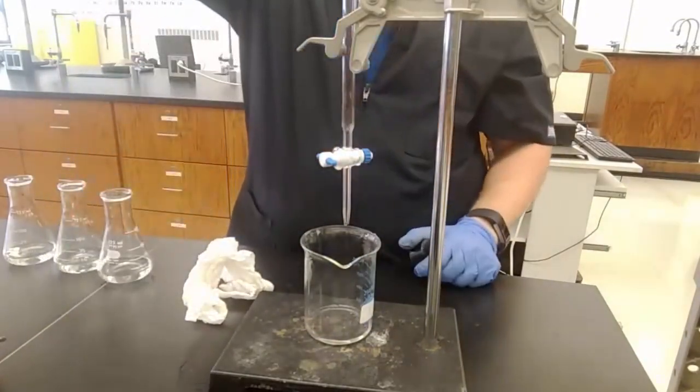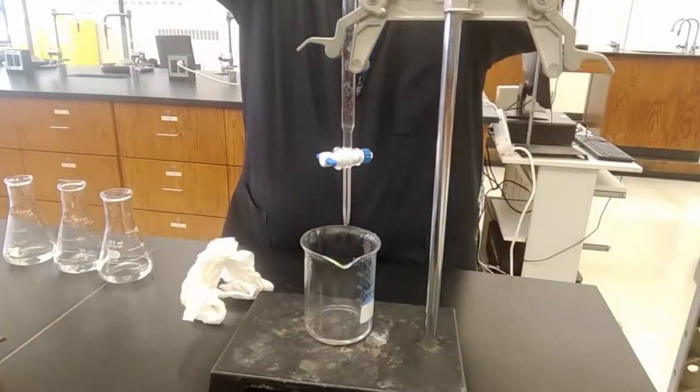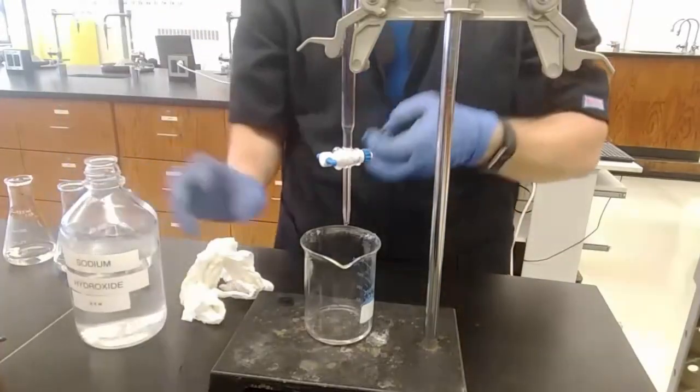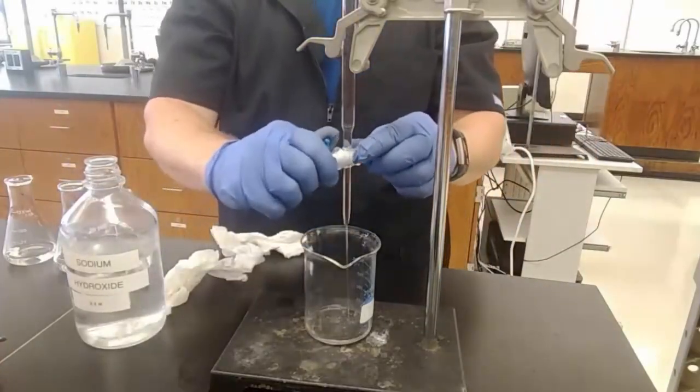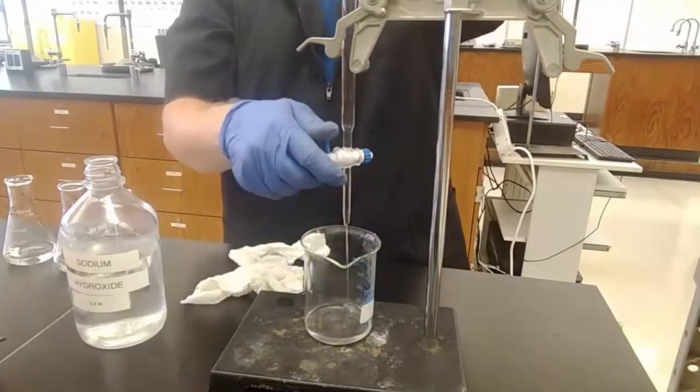If I have any air in this tip once I've filled it, not allowed. Again, I'm going to fill it with base. It says don't waste your time filling it exactly to the zero mark with base, because there's no reason for that. I'm getting it where there's no air down in the tip.